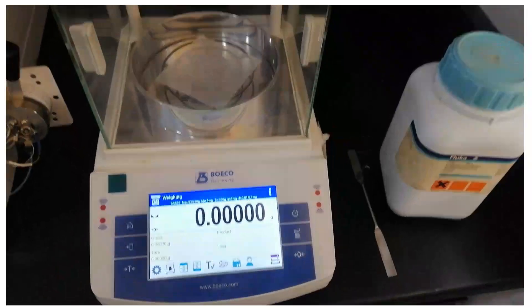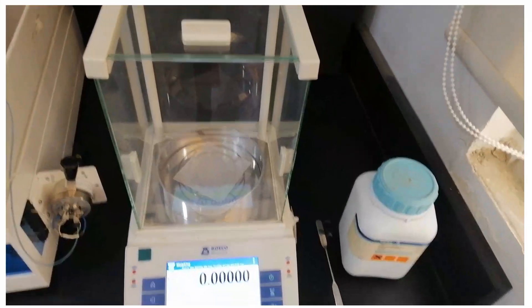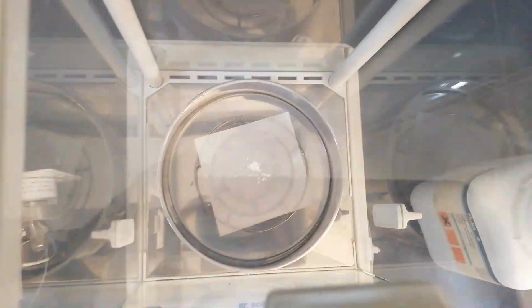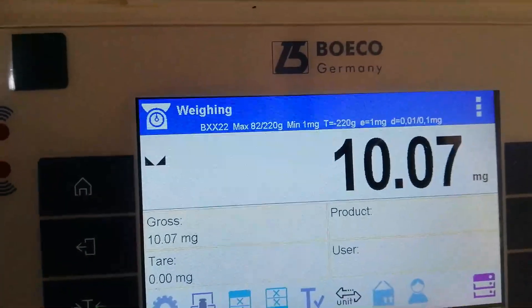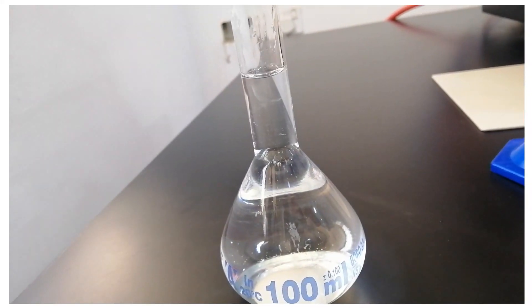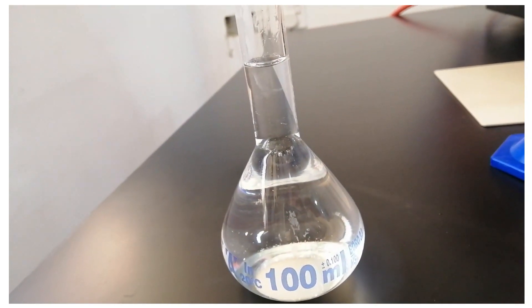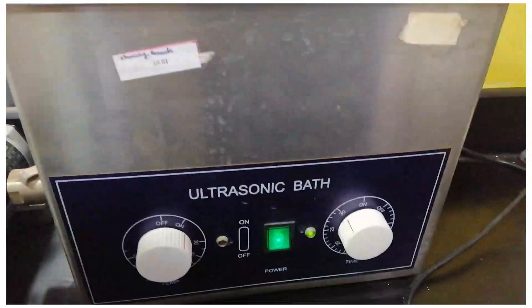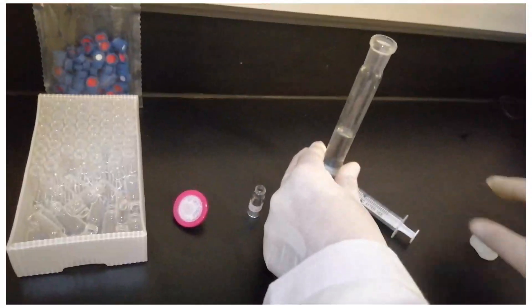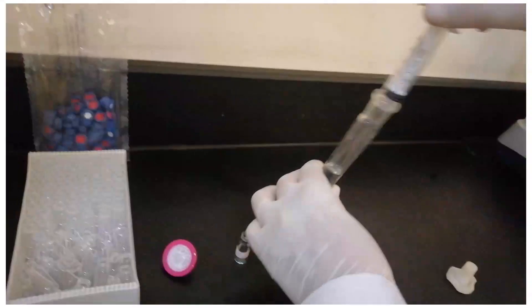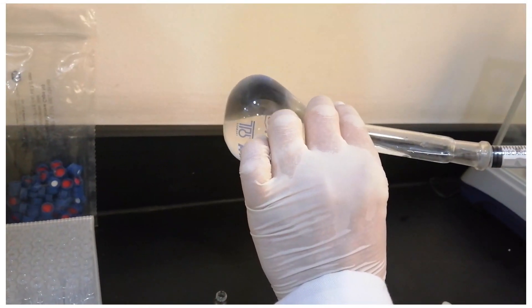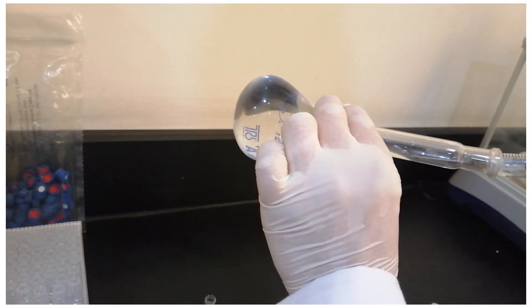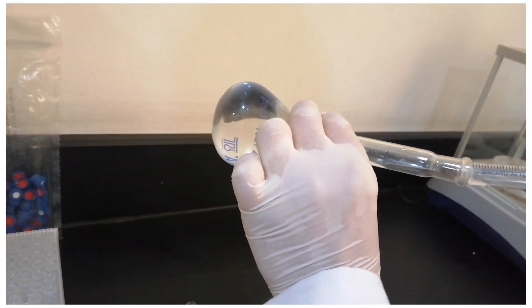Prepare a stock solution by dissolving 10 mg into 100 ml water for injection. After de-gassing, draw approximately 1 ml of solution into a plastic syringe. Next, attach a filter tip to the syringe and push the solution through the filter into a glass vial, in order to remove any solid particulates.